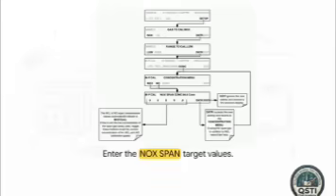Now, the default factory setting typically sits around 100 ppm, but you're going to use the menu to dial in your precise 80% target. From the Cal menu, just select Conc to enter the concentration menu, and then pick NOx. From there, you use the toggle buttons to input your exact span gas value.